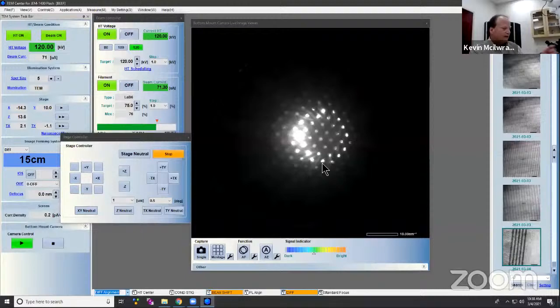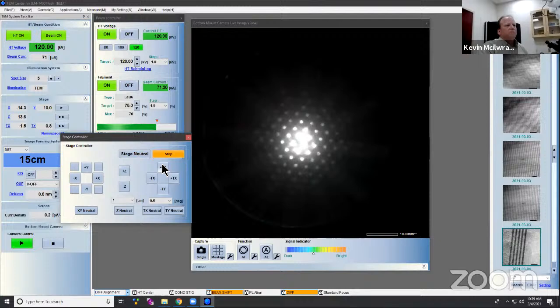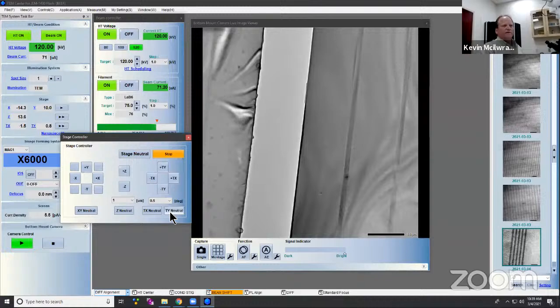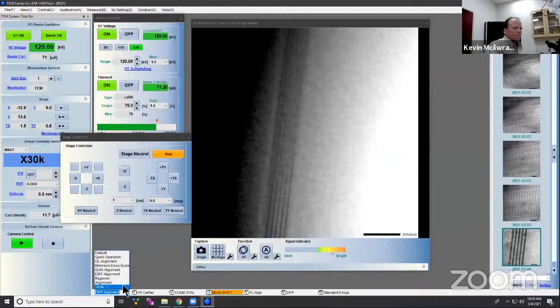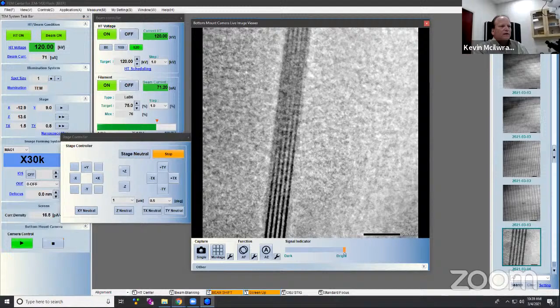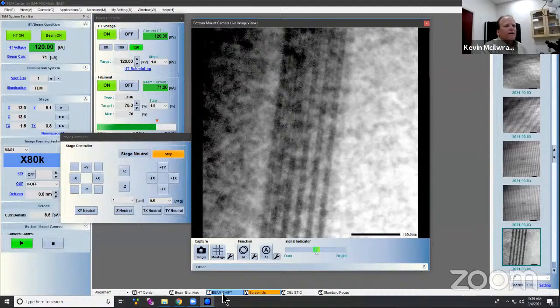And we can see it's off, right? So I kind of bounce around a little bit because there we go. Okay. A little better. We can see the Kikuchi lines. That's actually a much better image to deal with. And so let's spread that out. And I'll just zoom back up on this again. Center that. Okay. Oh, better. And so now I'm closer to zone axis, right? So I haven't focused yet, but I'm going to get a little bit clearer image of those inner lines, I think.